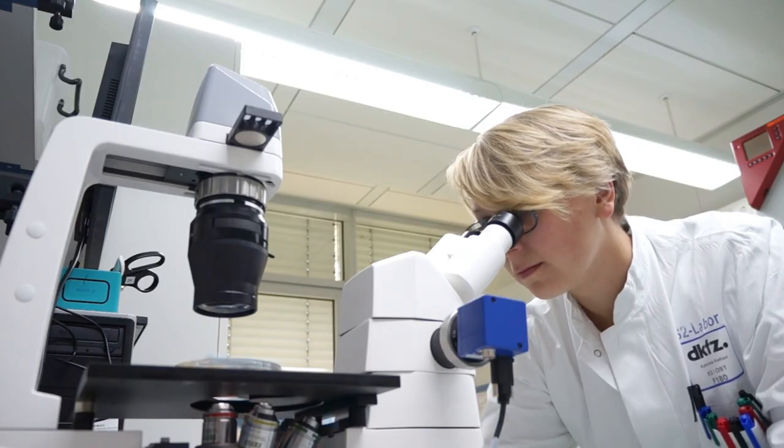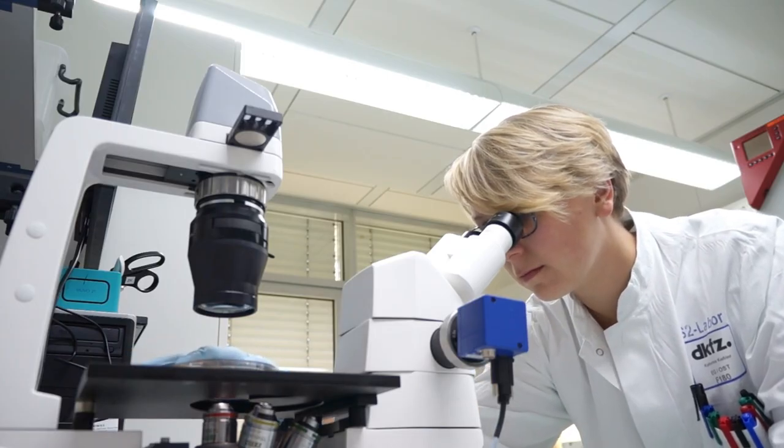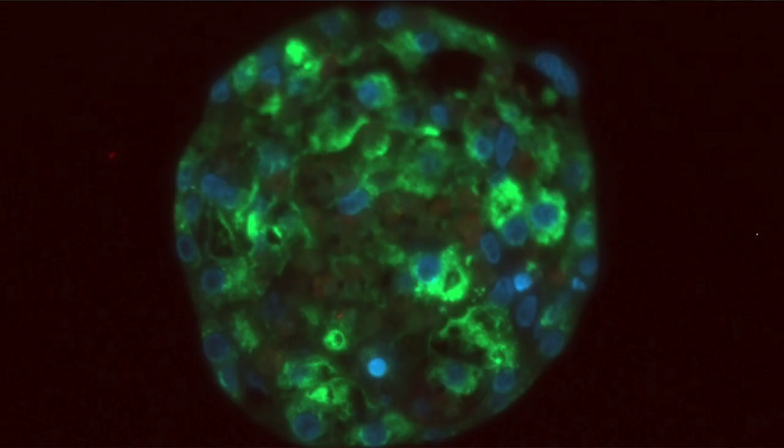Over weeks we can cultivate hepatocytes in 3D due to the fact that the CERO technology reduces the shear forces for those cells and for the tissue as such. We can then really investigate for a very long time the human tissue in a 3D context in a cell system.